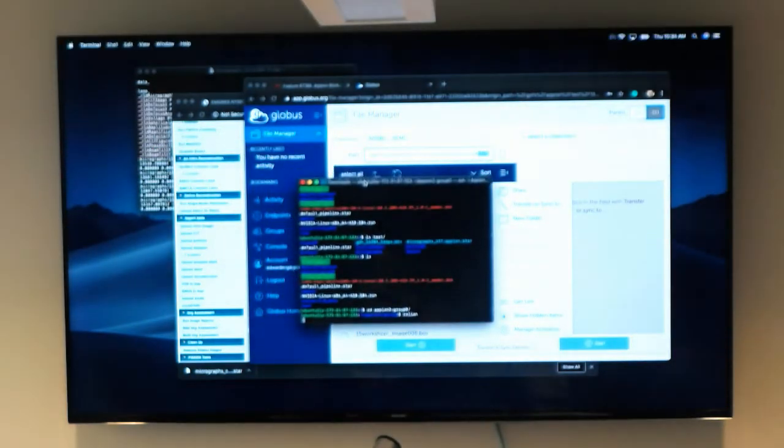So what has been done for us already is we started up several different instances on the Amazon cloud. We have several different groups. You have IP addresses to go to start up a nice environment where Relion has already been installed. So again, group 1, group 2, group 3, group 4, group 5, group 6. And then in case you run into trouble, you can always hop into my instance.